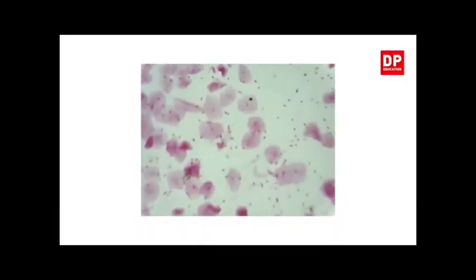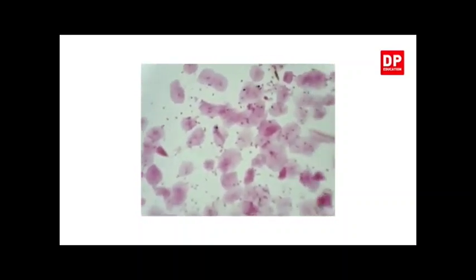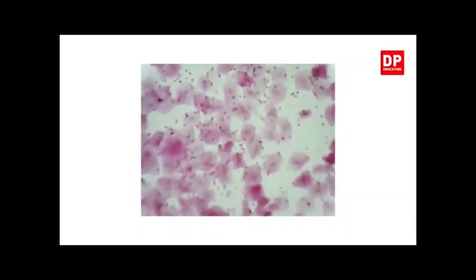So now when I move it upwards, if you can't see clearly, you might have to move it down again. And then when you watch, you can see the cheek cells in that specimen. You can see circular shapes. Different sizes but circular shaped cells in that sample.